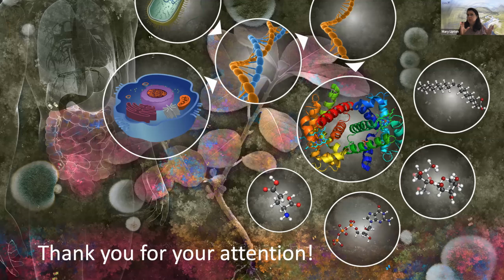However, if you lyse in situ, which basically should eliminate the bias of what comes off easily, you're biasing against that which will lyse easily in the presence of soil. And so we do a bead beating and a sonication step, as well as the presence of a detergent to help liberate the proteins. So it's either method, and it all depends on what works well. I think if you have a sandy soil, it's a lot easier to get the proteins off because there's not as much minerals for the proteins to bind to. When you start getting into clays and loams and other types of soil, you start getting a lot more attachment of the microbes onto the soil. And I just gave you a generalization that you can probably prove me wrong in whatever next soil you have.